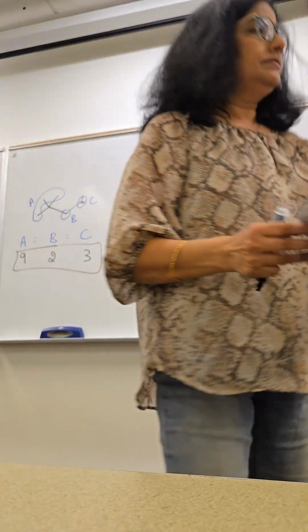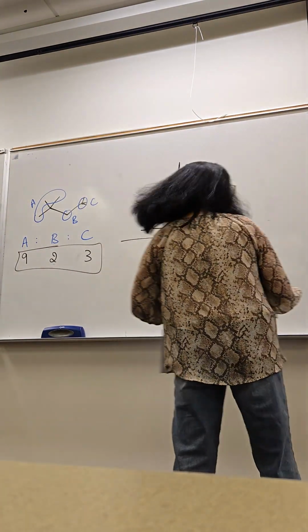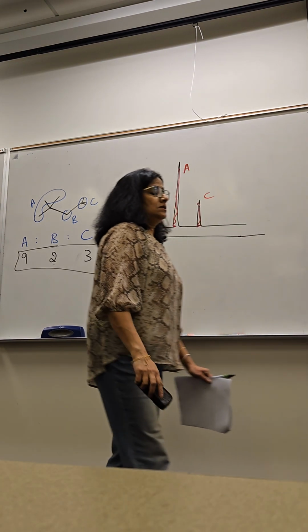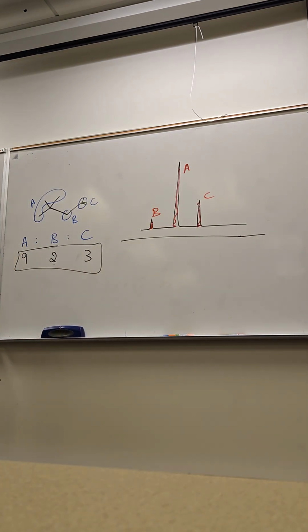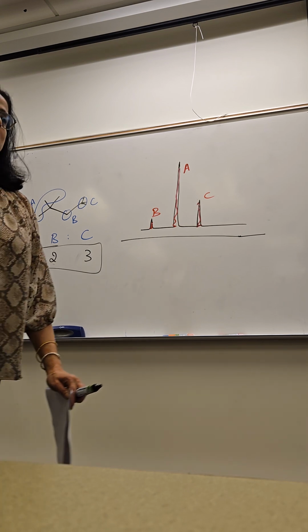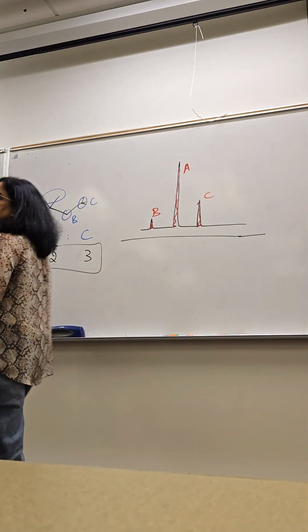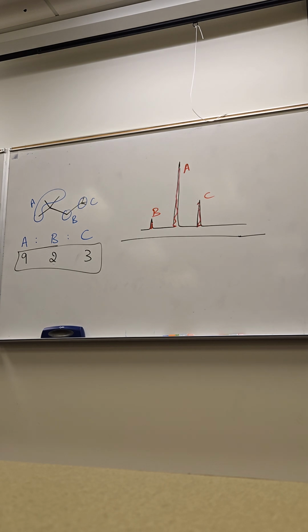If you looked at just an NMR spectrum, you wouldn't be able to pick out which H's are what. You'd only get the ratio of unknown H's. Don't call it a graph, please, say spectrum. So if you're looking at the spectrum and you just see those big spikes and don't see the molecule, and you're trying to find what the molecule is, do you know which H's they are? I hear your question. I'm just trying to phrase the answer in my head first.